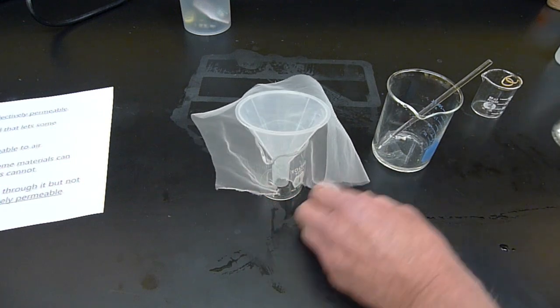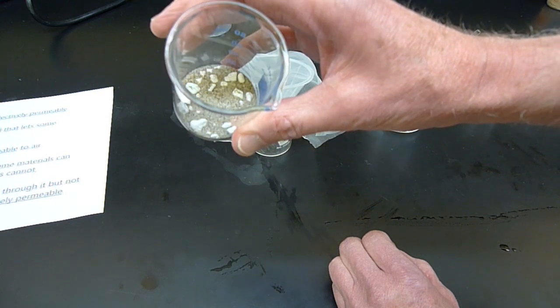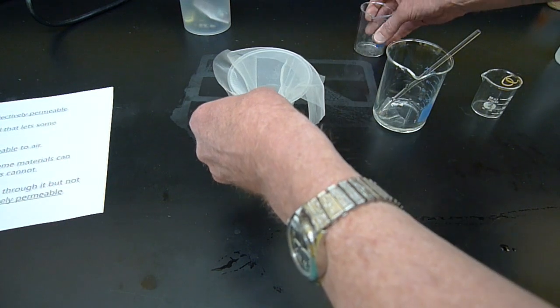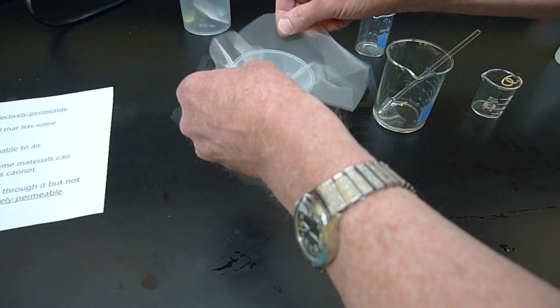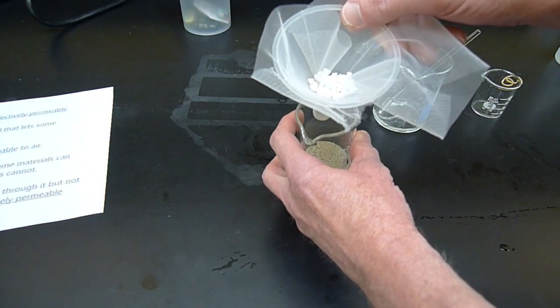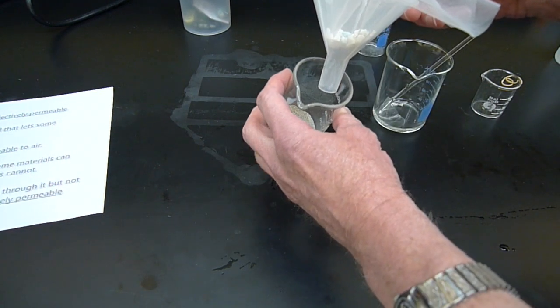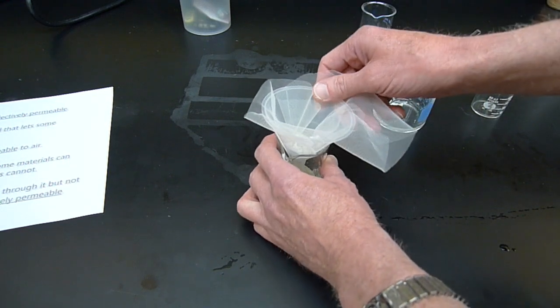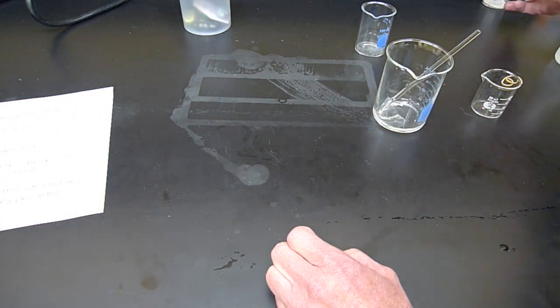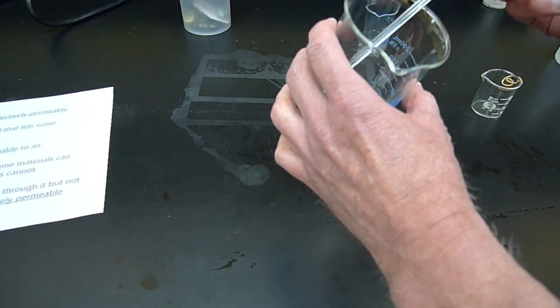And here I have just a mixture of some sand and some little white chunks. These are called boiling chips. If I simply pour this over the nylon mesh and let it bounce around a little bit, you can see that the sand passes quite easily through the nylon mesh, but the boiling chips, the white chunks, don't. So this mesh is selectively permeable too, obviously just because of size. The sand particles get through easily because they're small enough, and the boiling chips are just too big. Obviously, cell membranes will prevent or allow stuff to go through based on things other than size, and that's what you can deal with in your lecture section.